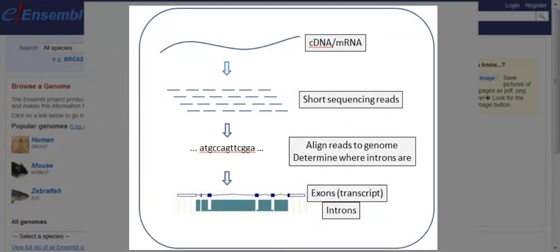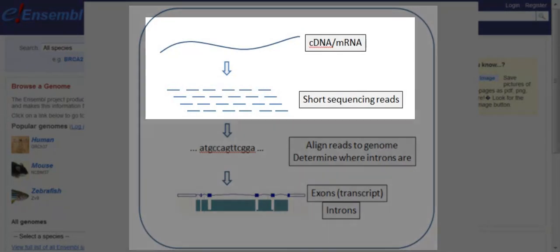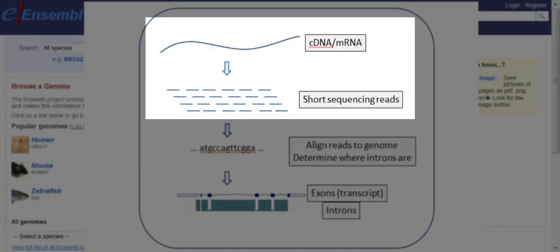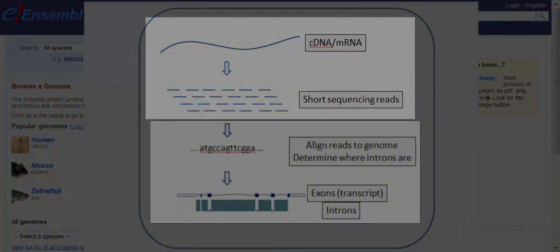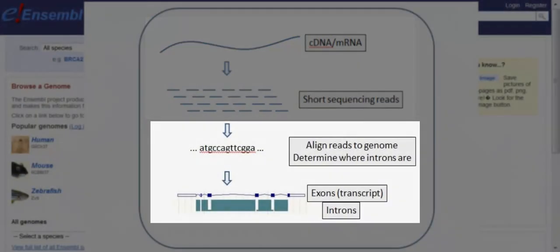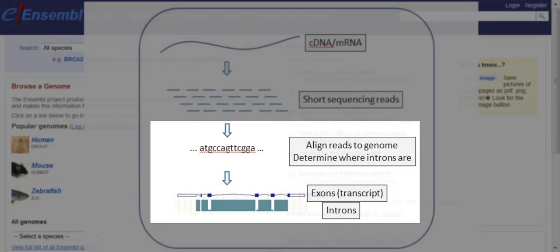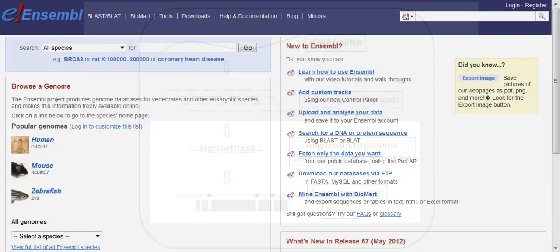RNA-Seq, as you might already know, uses high-throughput sequencing technologies to sequence cDNA. In this way, we can get information about a sample's mRNA contents. RNA-Seq tells us, on a genome-wide level, which exons are expressed in different tissue types, diseases, and conditions.